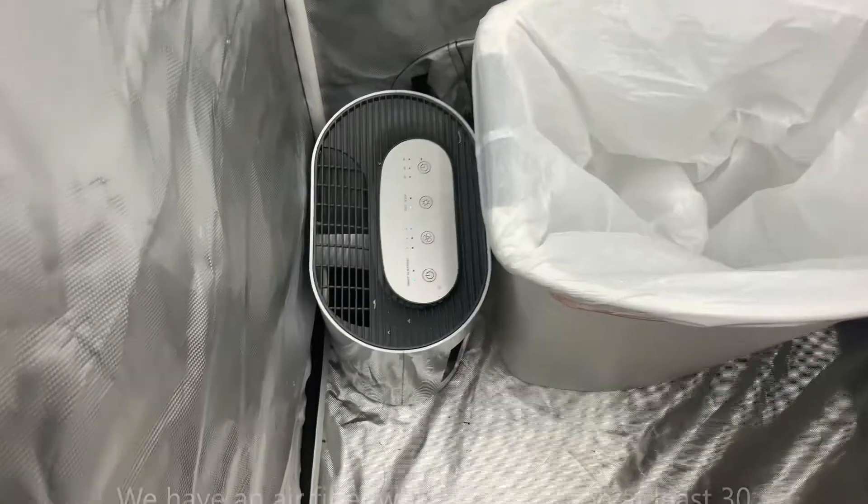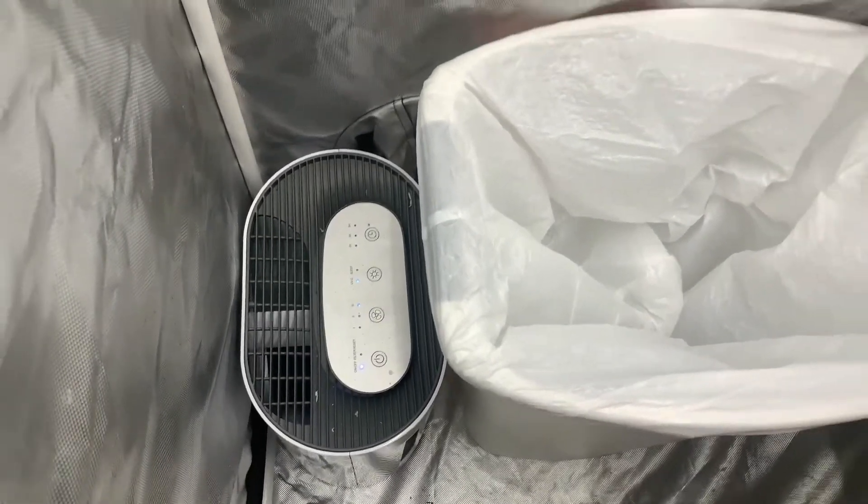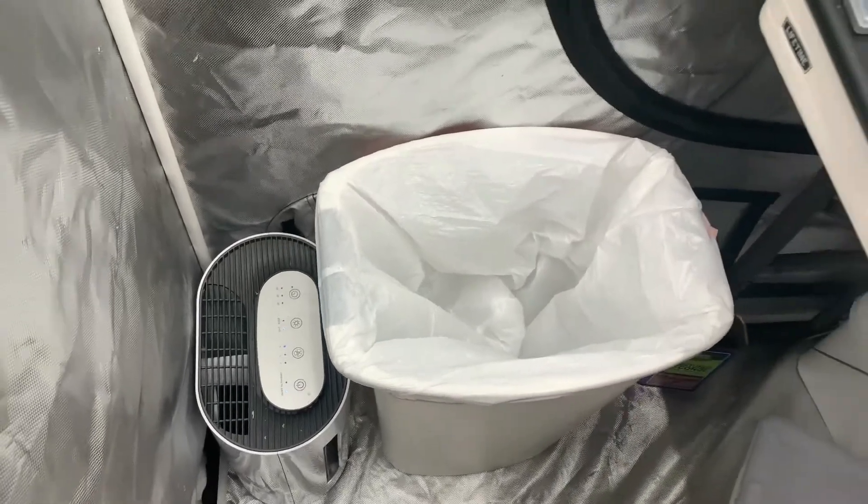If you don't have access to a laminar airflow hood, you can still put on an air filter and that still works pretty well. We turn ours on about 30 minutes ahead of time.